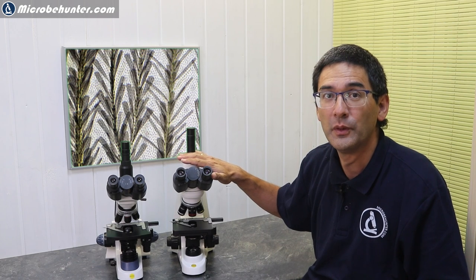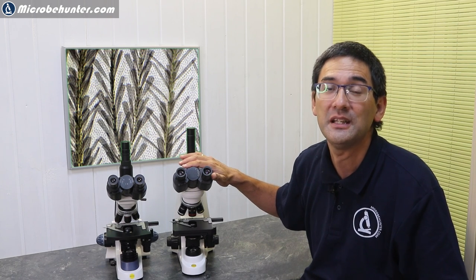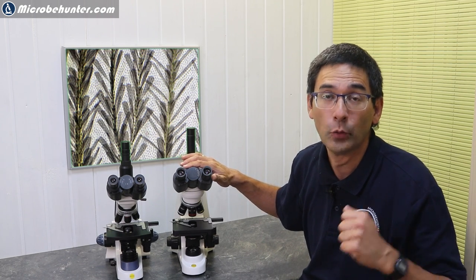However, I also must say that when you check Amazon to buy these microscopes or if you check the Swift website, the Stellar One is also available with the 160 millimeter DIN optics as well, at a lower price.